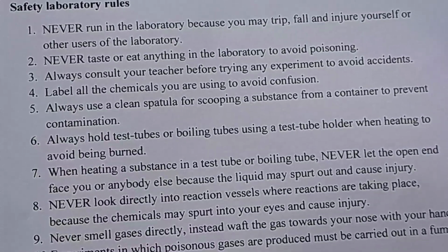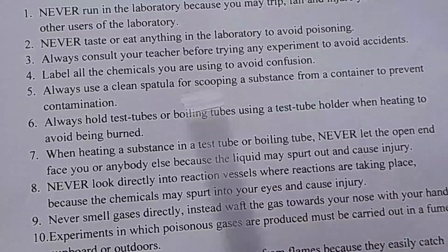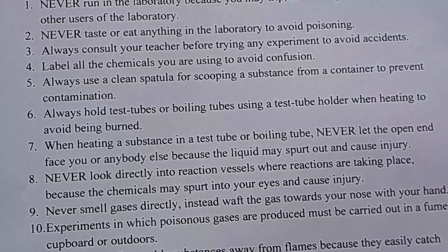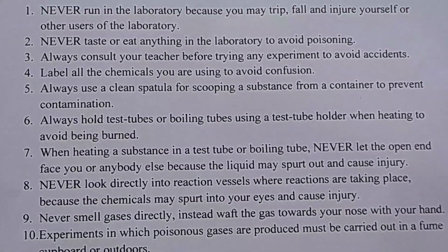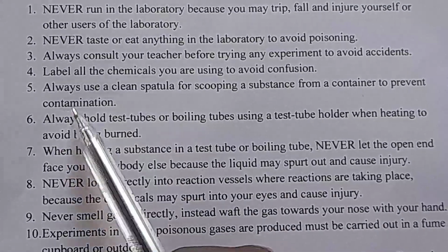Number five, always use a clean spatula for scooping a substance from containers to prevent contamination. Remember, we were having an apparatus called spatulas. Spatulas are used for scooping solid substances from containers. So you have to use clean spatulas to avoid contamination.